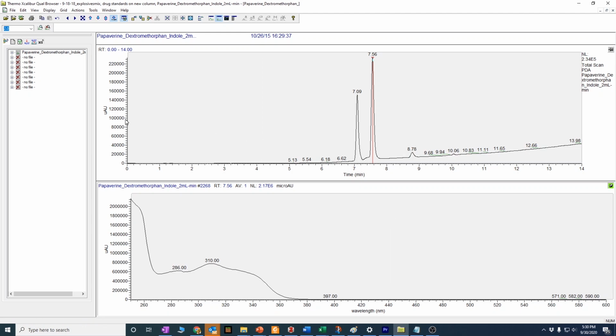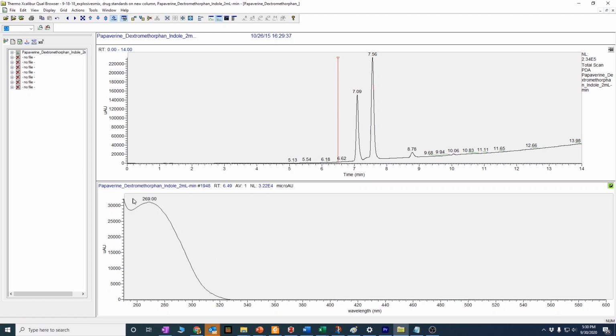Now, when we get data like this, where at each point in the chromatogram we have a full spectrum, we also have a second bit of instrumental data at each point. We have to figure out how to plot what's on the y-axis. Okay? Because there is no one data point for this. Here at scan 1948, if we look down in the corner, you can see it says the intensity here is 3.44e+003. So it's saying on the chromatogram the intensity here is 3,400. Well, where is it getting that intensity from?